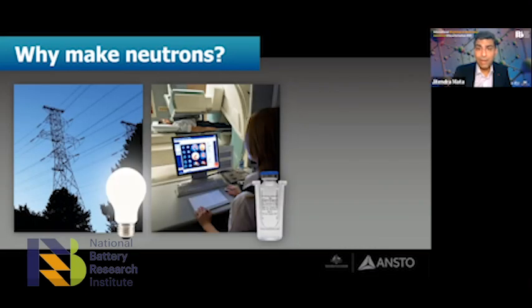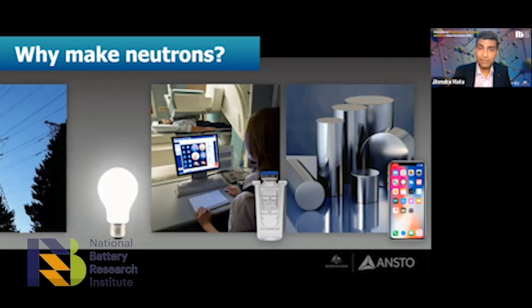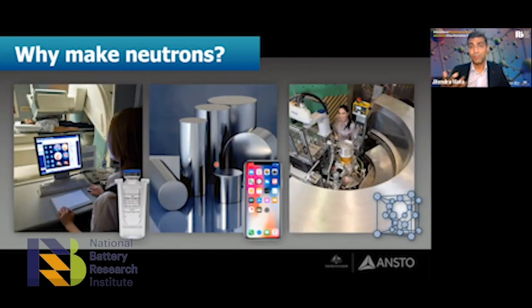Pharmaceutical purpose, or you can use it to enrich the material. So for example, silicon irradiation is one of the things. We do not care about the production of electricity. It's a very small reaction. But what we do care about is the material characterization, where my job is basically. So here is a photo of one of my colleagues, Vanessa Peterson, and she looks after the neutron diffraction instrument, and it's an amazing instrument as well.